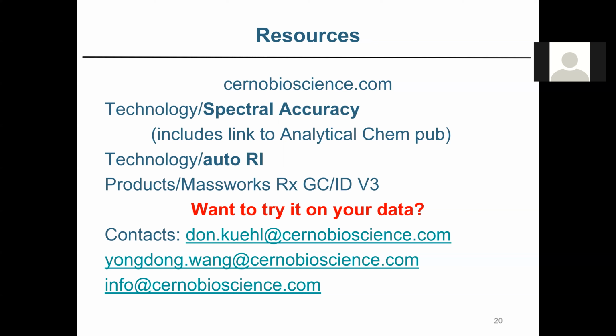Okay, we're going to take one last question, and then if you have any more questions, feel free to reach out to us through email or other means of contact. We'll take one more question here in the chat box. If the deconvolution is not successful, can it somehow be complemented by other mechanisms like retention index and accurate mass?